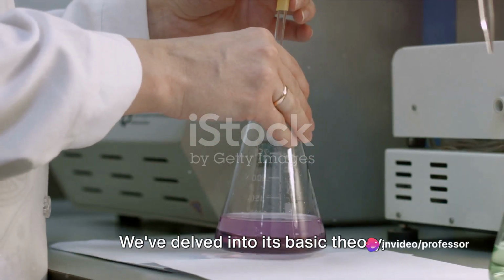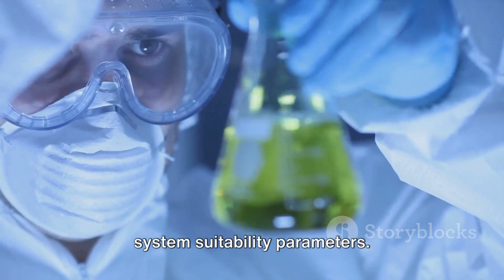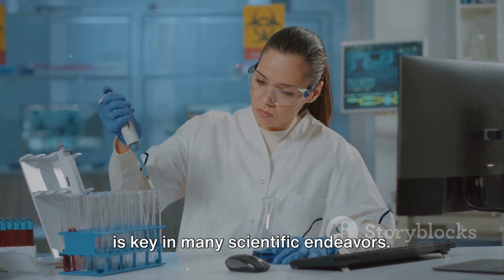We've delved into its basic theory, explored column chromatography, dissected the Van Deemter equation, and examined system suitability parameters. Remember, the art of separating mixtures is key in many scientific endeavors.